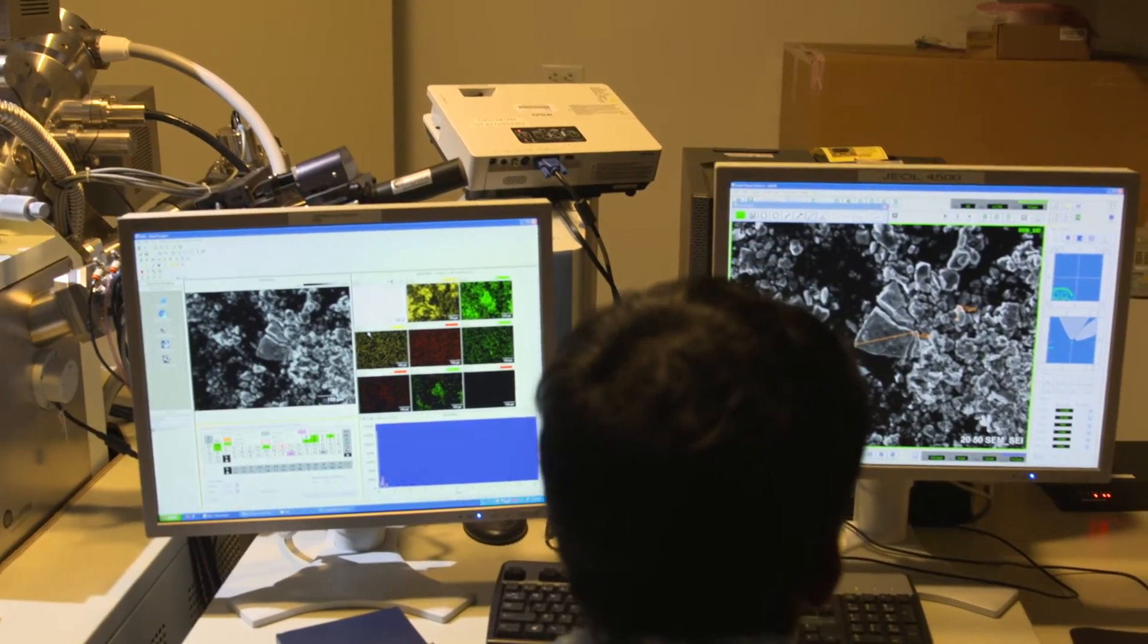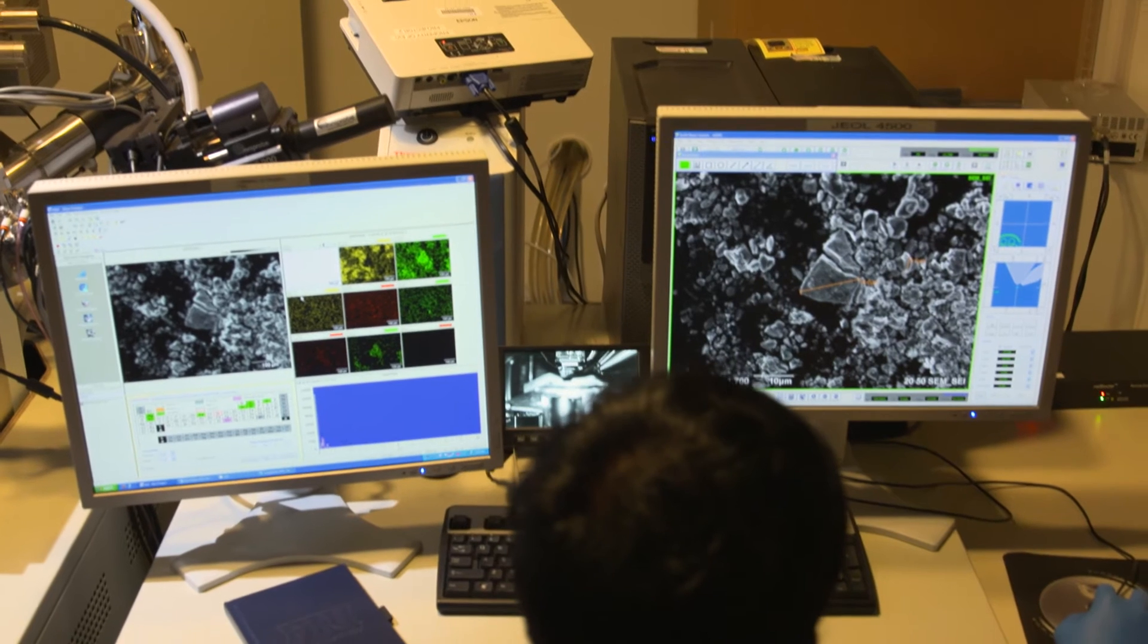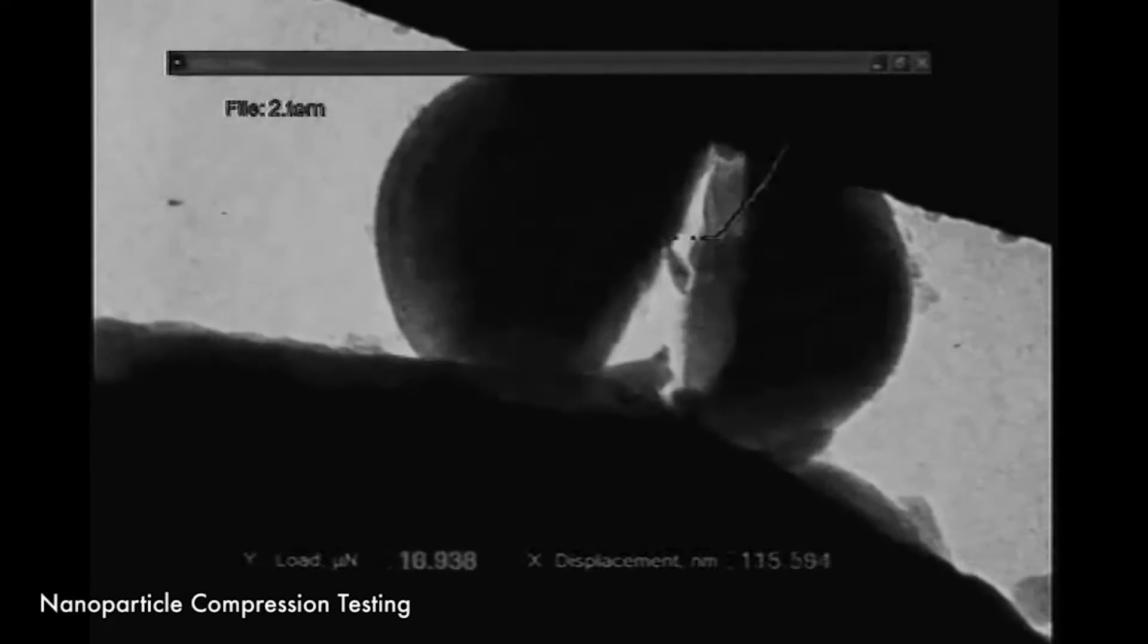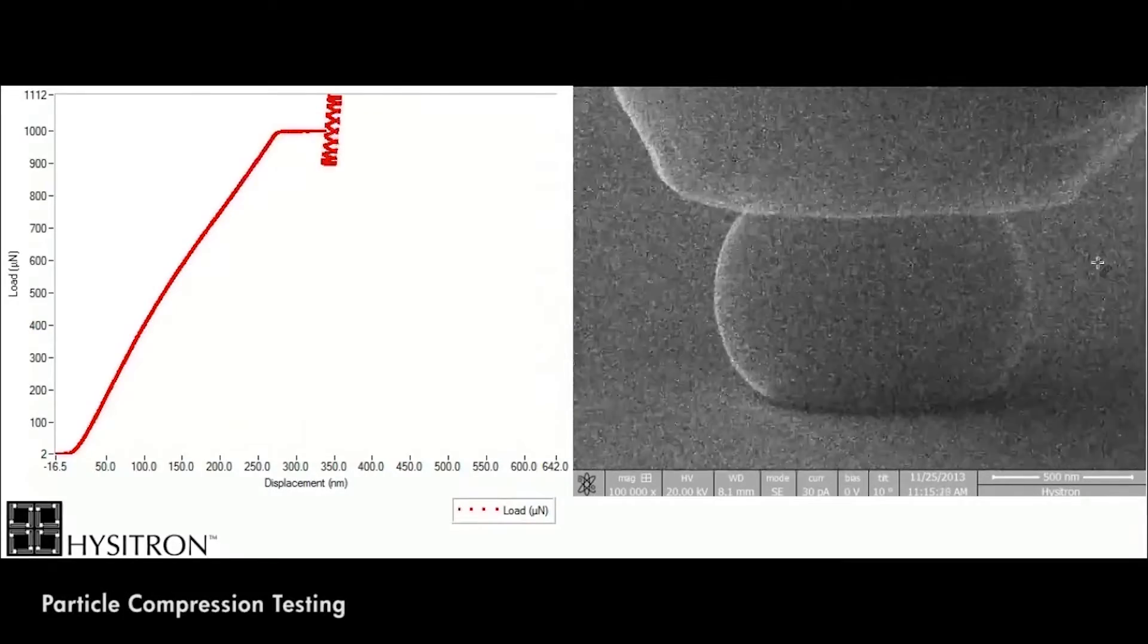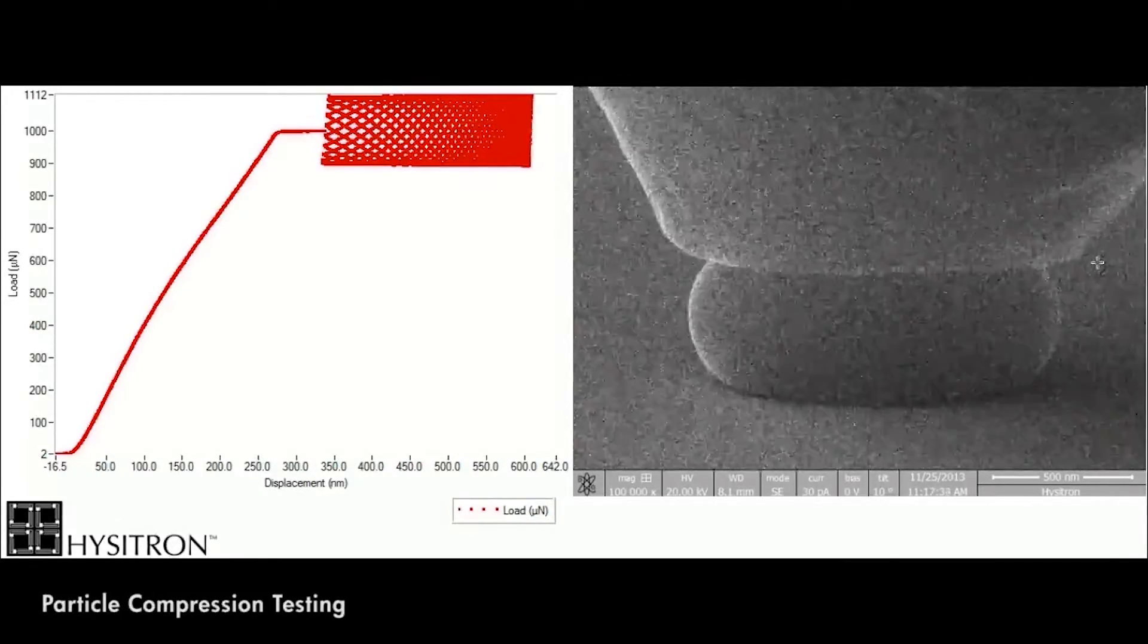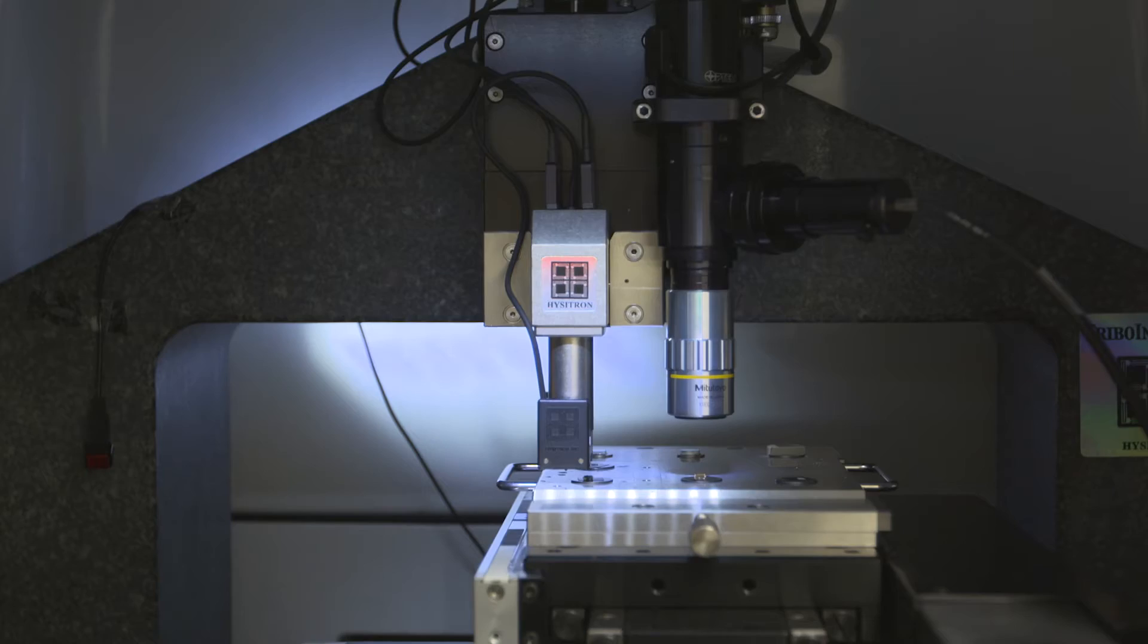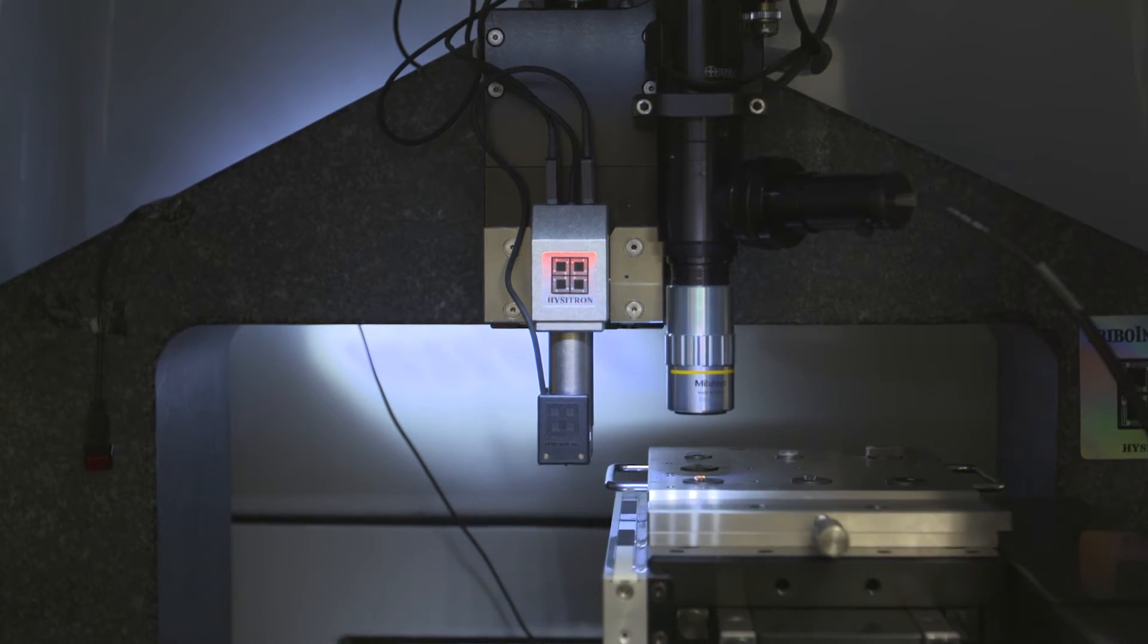The response of advanced materials developed by AMERI users can be monitored in real time at the nano scale, guiding future processing and drastically reducing development cycle time. A stand-alone nano indenter is also available for high throughput analysis of material behavior.